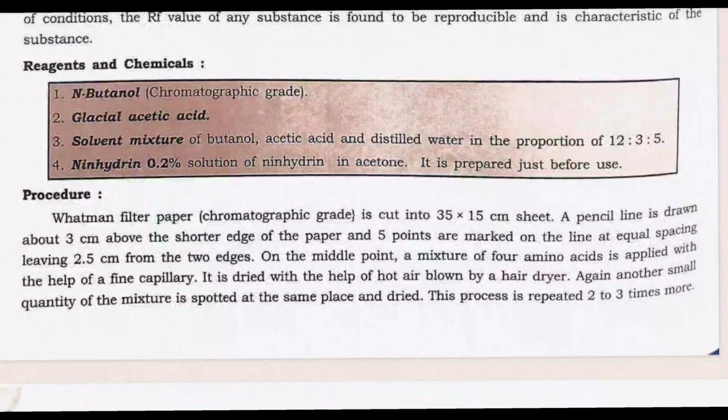It is dried with the help of hot air by a hair dryer. Again, another small quantity of the mixture is spotted at the same place and dried. This process is repeated 2 to 3 times more.